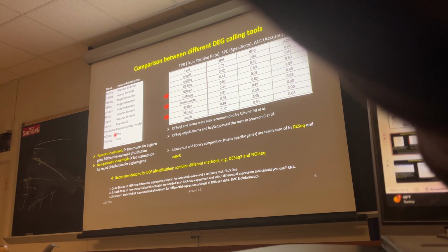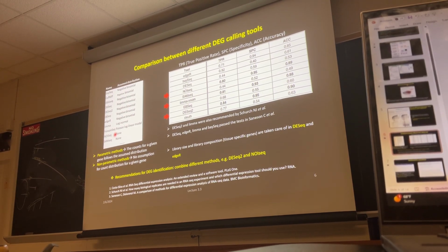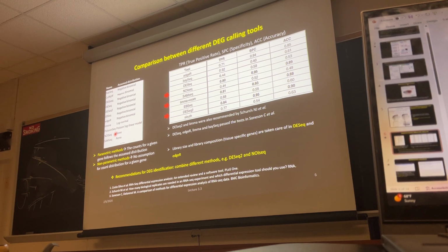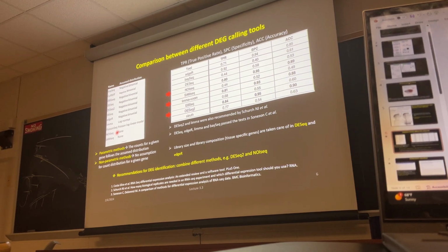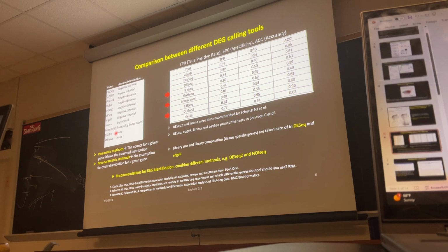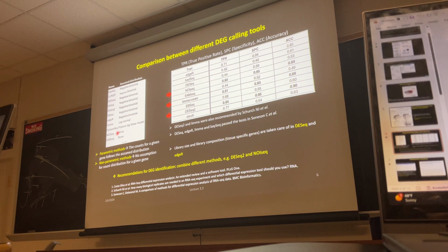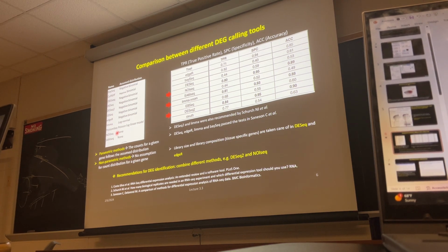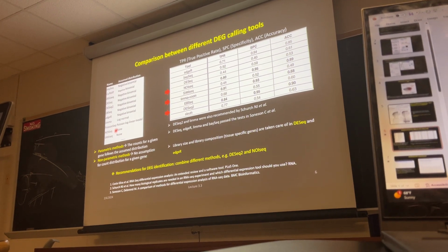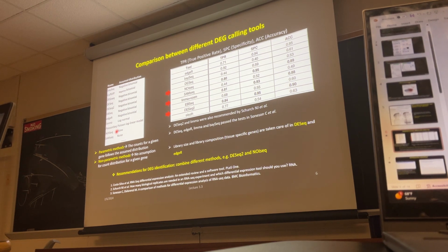I have a question. When would you want to assume the distribution? Most of the time, when you have this RNA-seq data and plot your data set, you will see some type of distribution. Most of the time it is a negative binomial distribution, the regular distribution that we assume. But when you have only one replicate, for example, where you cannot compare between the replicates, at that time you assume there is no distribution. Then you have to decide, okay, I want to use NOISeq now.